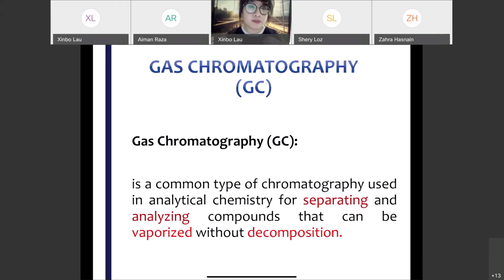The major working principle is the same, right? You use the thin layer, that silica gel, that's what you have, right? So that's the stationary phase. And then you also use that to separate your samples. So the working principle is similar.